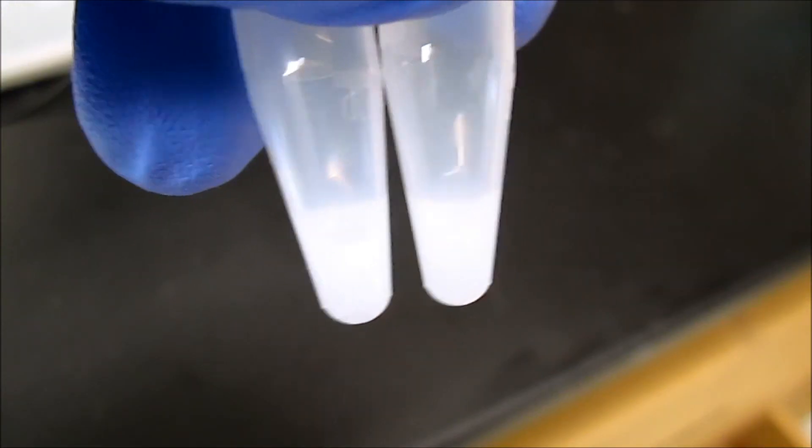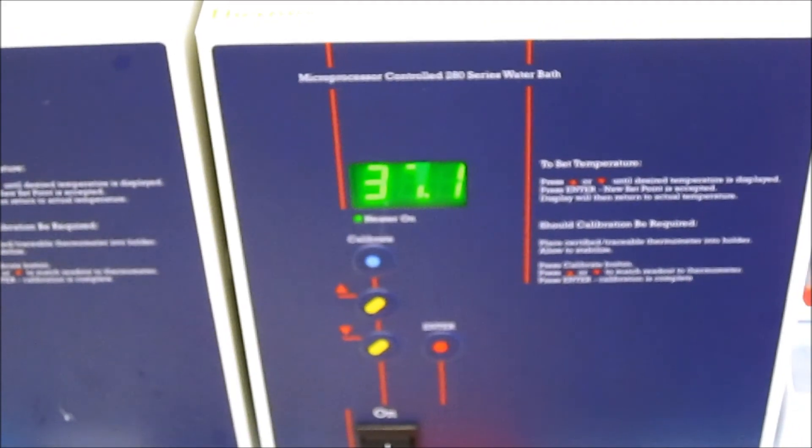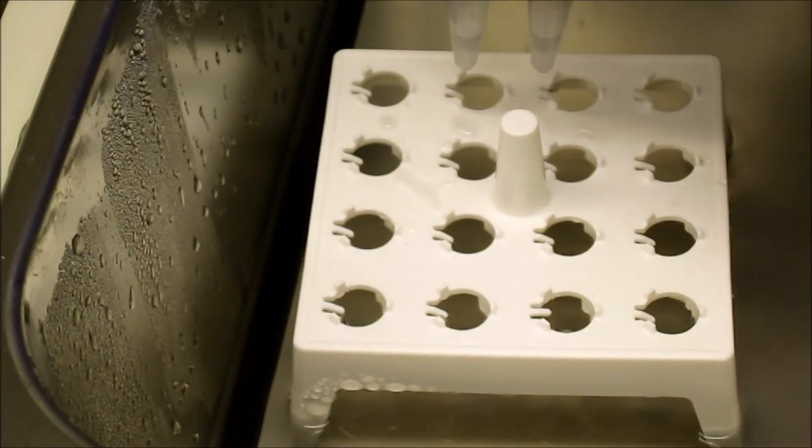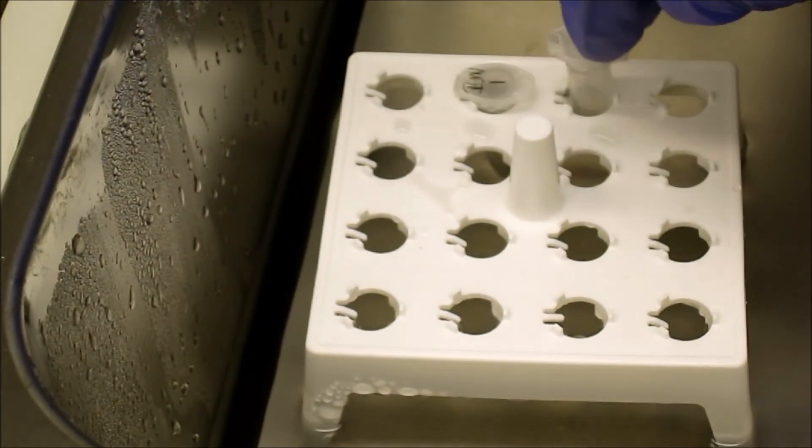Upon addition of PEG, the particles should again appear cloudy. Each sample is incubated again for 30 minutes at 37 degrees Celsius.